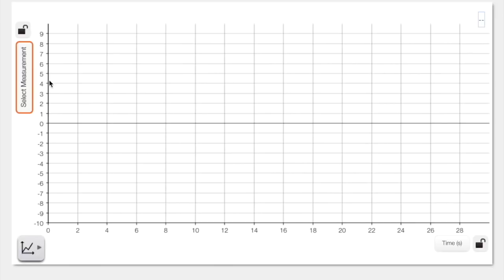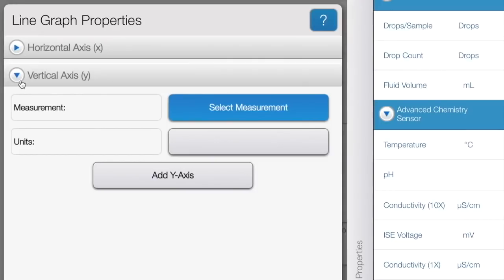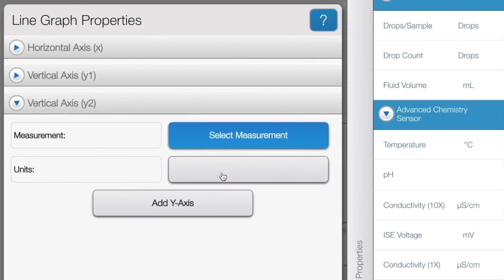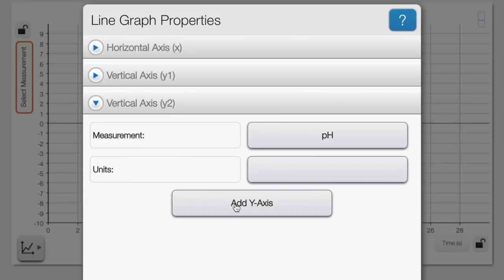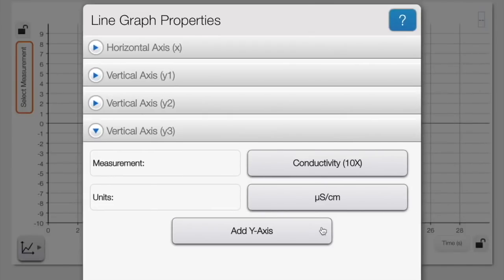Now push Select Measurement next to the y-axis. Then press the Select Measurement button under the vertical axis tab. Add the quick response temperature sensor from the menu on the right. Then press add y-axis and add the pH meter from the advanced chemistry sensor menu on the right.